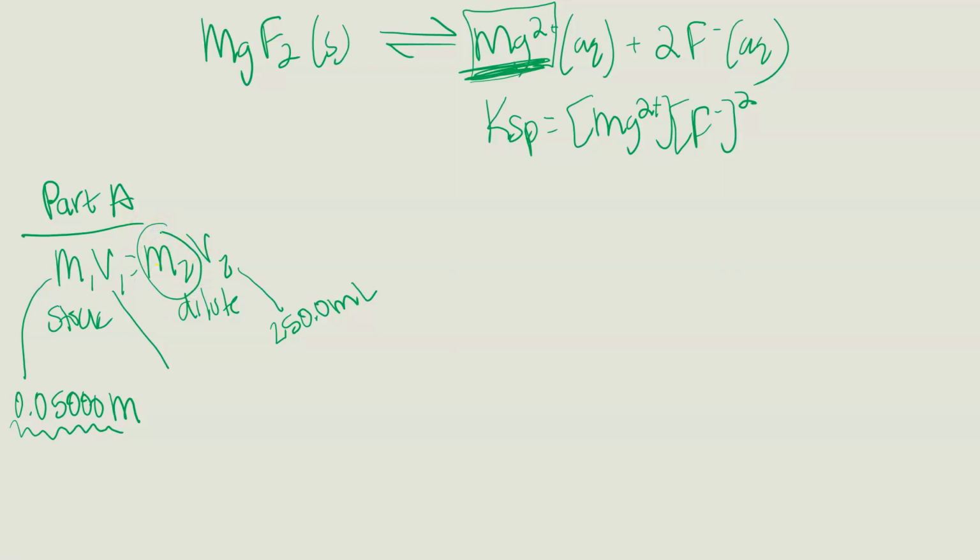And that's how you're going to get the value in the first column on your data table after you write down whatever the number is of this solution, which is where it says actual concentration of the stock magnesium chloride. You're going to write down whatever that number is on the board. Magnesium in molarity, you're doing the M1, V1, M2, V2.